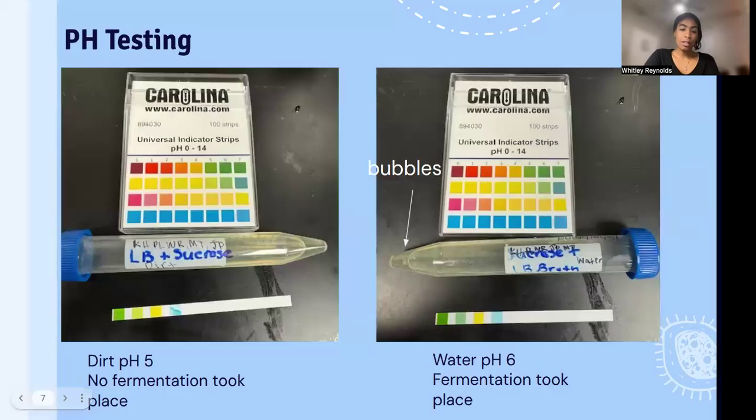This contains the pH testing results. These strips show how the bacteria samples altered the pH of their environment. This is important because bacteria often change the acidity of the medium they grow in. The color shifts on the pH strips confirm that growth occurred and also help us determine which samples were most metabolically active.